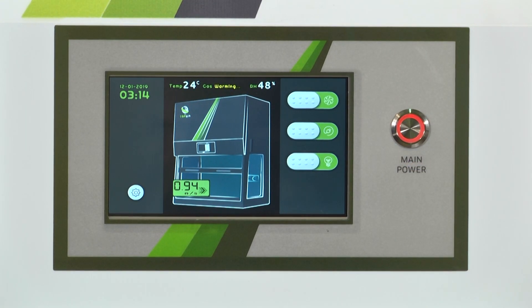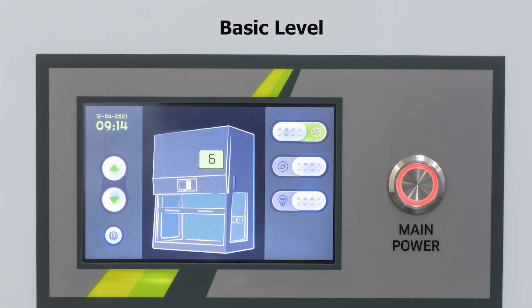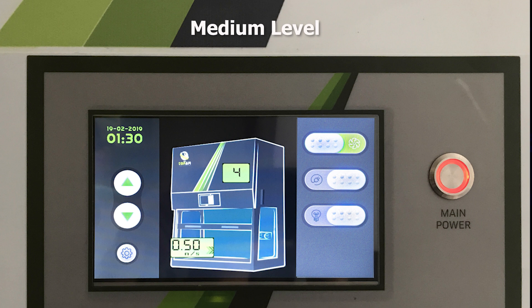The ductless fume hood offers three types of operation systems, all with a color touch screen. Basic includes a 5-inch touch screen, 10 air velocity options, and controls for on/off, lighting, and electrical outlets. Medium includes a 5-inch touch screen, air velocity display, an alarm for low air velocity level, and all the basic features.